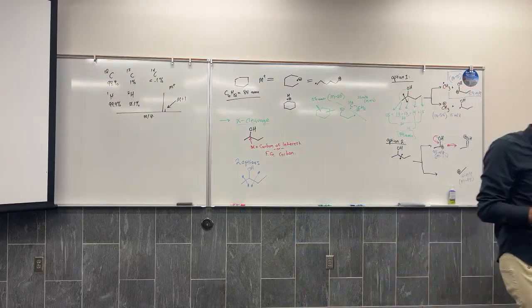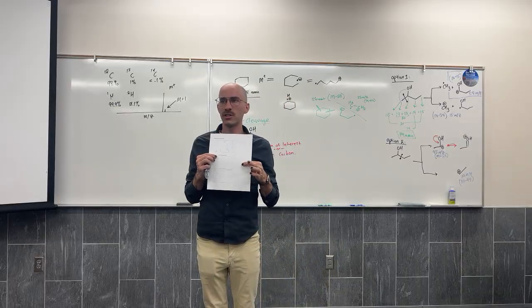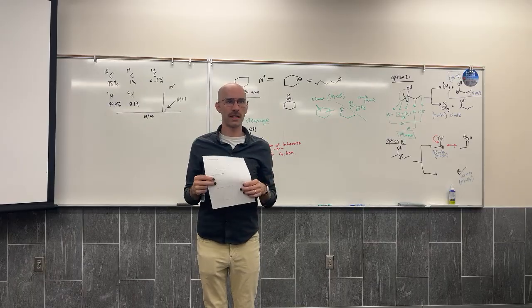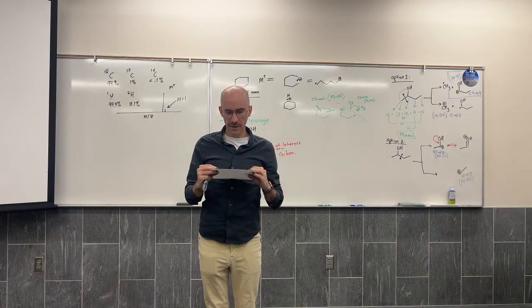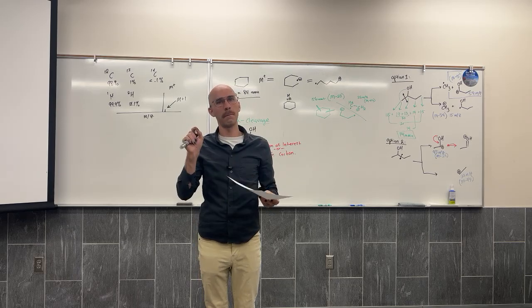If you look at the molecular ions we've seen, look at the molecular ion for benzoic acid, 122, and what do you see just to the right? An M+1, a tiny little peak, an isotopic cluster that comes from having these different masses. What do you see at cyclohexane? The molecular ion at 84, and then at 85, an M+1 signal.